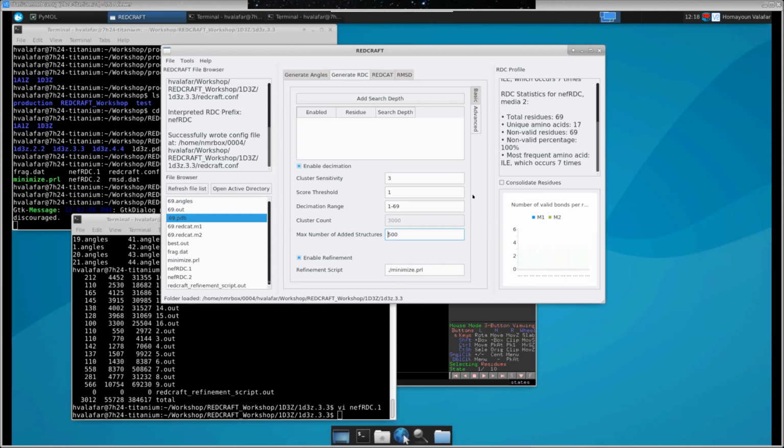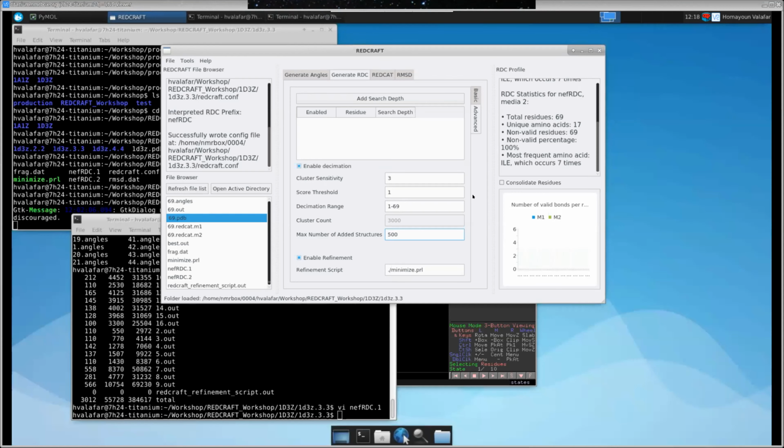And then it's the issue of collecting residual dipolar couplings, which from my understanding, as long as you have assignments in place, you can just run some sort of HSQC to collect your needed data.